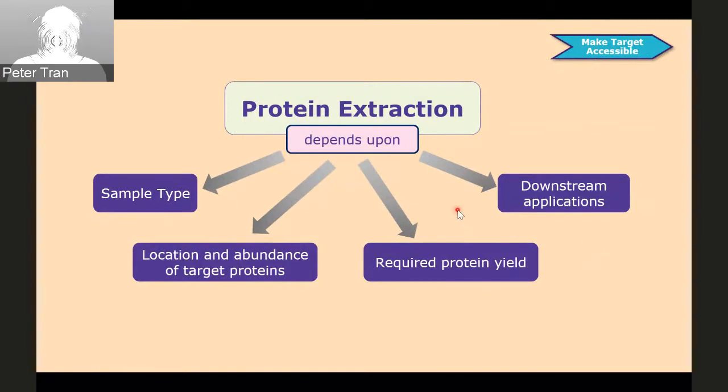And your lysis condition or lysis buffer needs to be compatible with downstream analysis like mass spec or Western blotting.